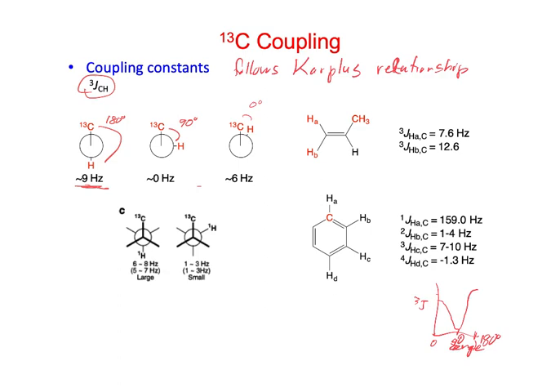Down here on the bottom, these are the examples. These are for 1 oxygen, and this is for 2 oxygens on these 2 carbons. And so if they were anti, 6 to 8, so just a little bit smaller than we said up there. And if they're gauche, 1 to 3, so a little smaller. Well, no, that's about what we would say for 60 degrees.